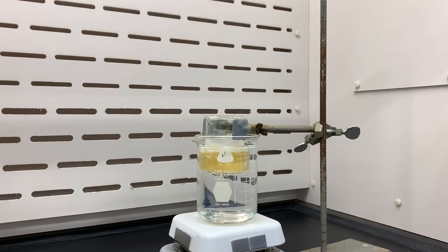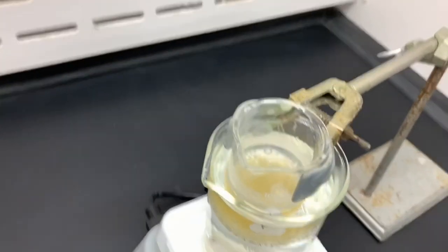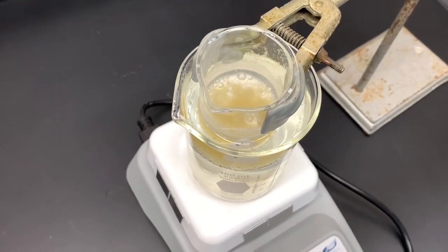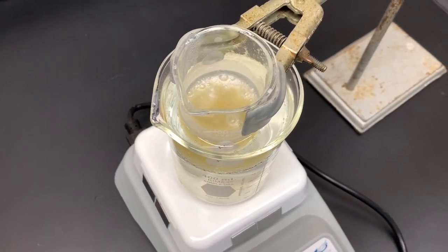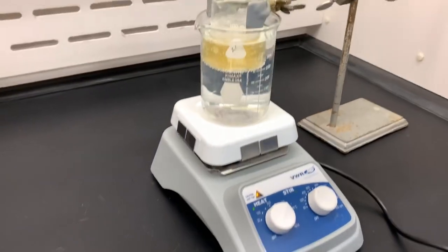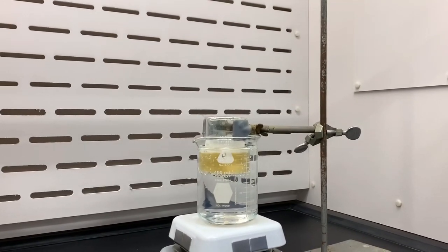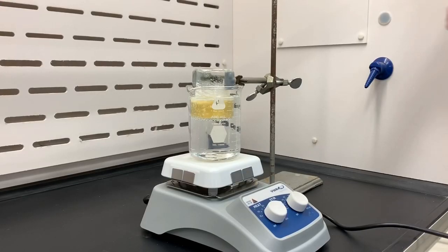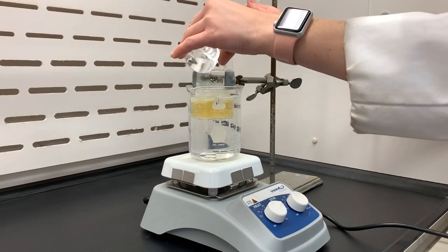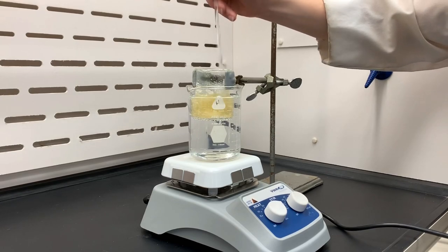The lab manual also mentioned that if the volume of the reaction mixture started to go down, to maintain the volume by adding a one-to-one mixture of ethanol and water. And so as needed, that was done as well in this experiment. Whenever the ethanol-water mixture was added, it would help dissolve some of that solid that had formed.